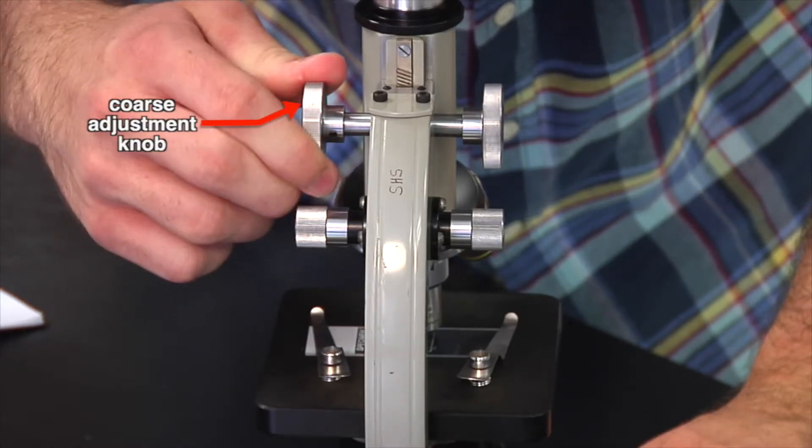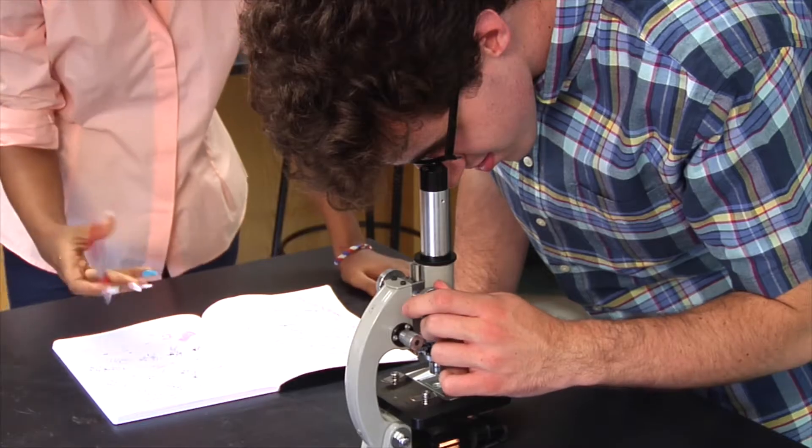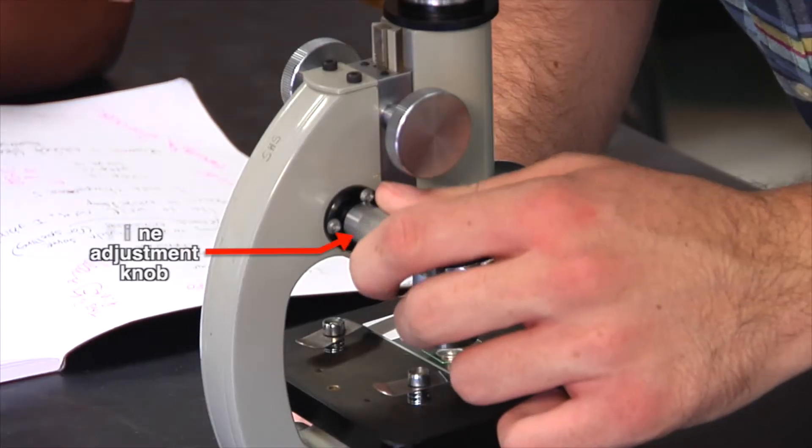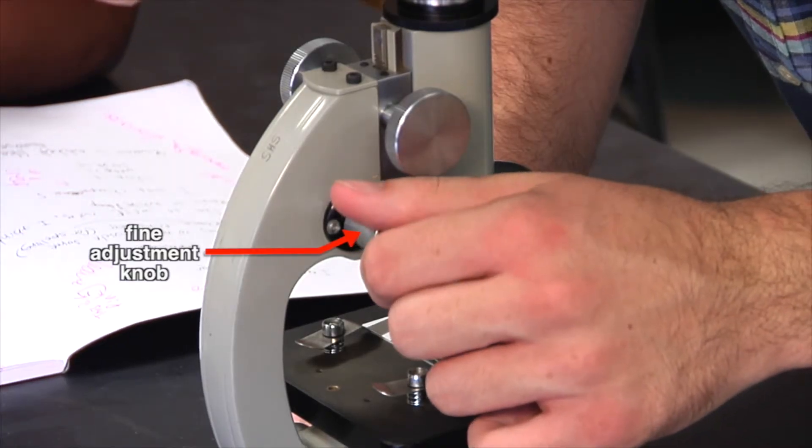Look through the eyepiece and use the coarse adjustment knob. Continue the adjustment until you see the specimen through the eyepiece. Now use the fine adjustment knob to be able to view the specimen more clearly.